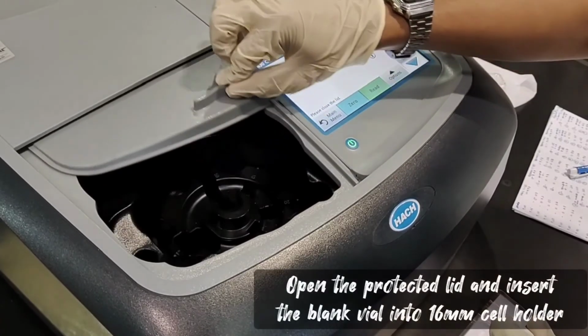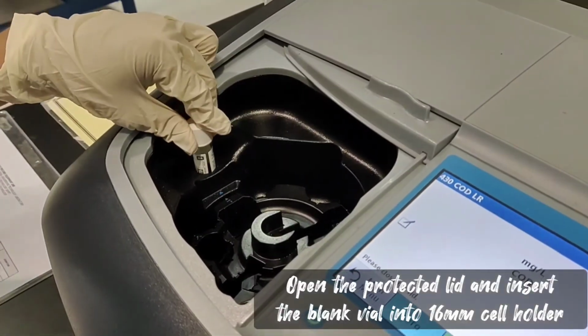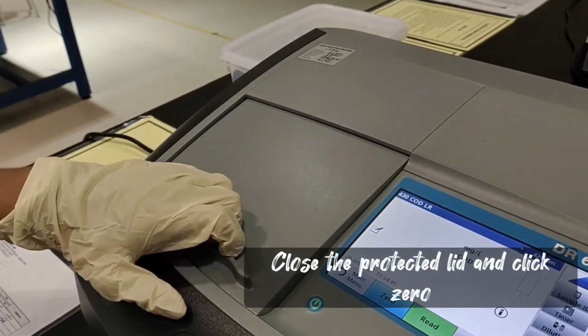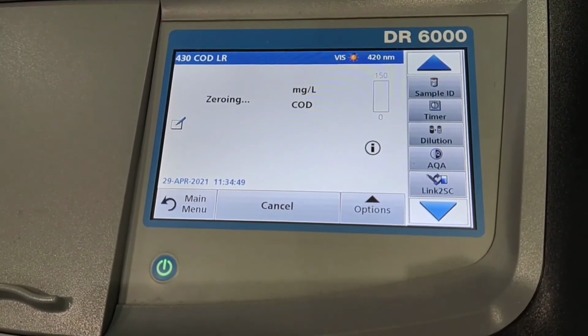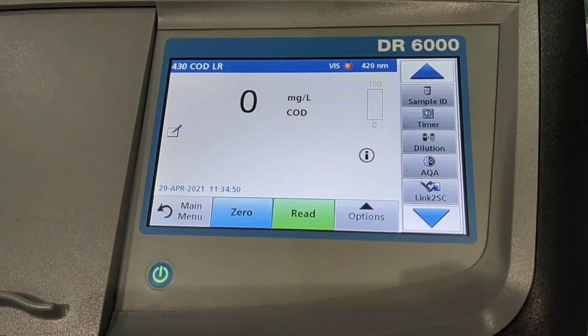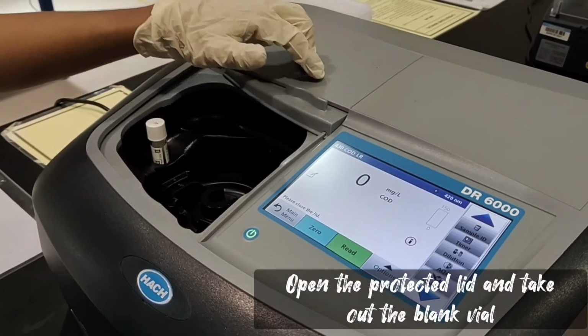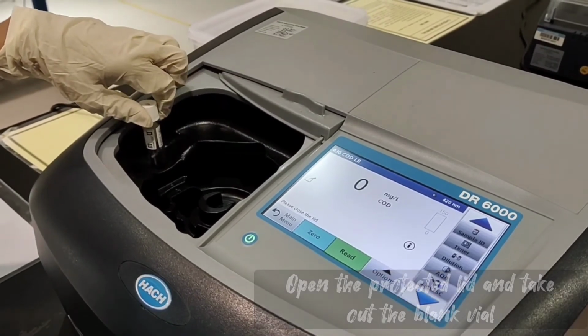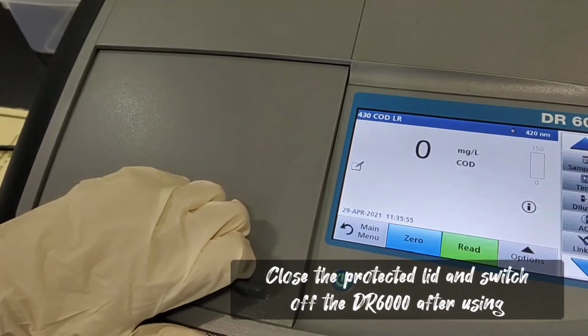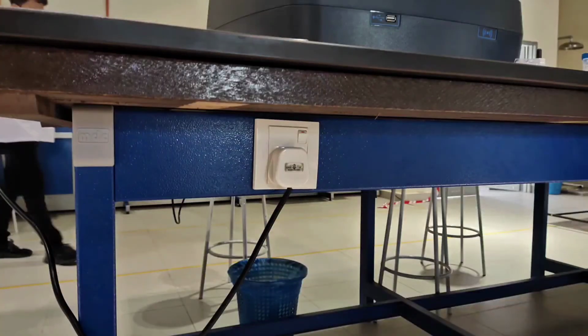And then open the protected lid and insert the blank vial into the 16mm cell holder. And then click Zero until the 0 displays on the screen. Open the protected lid and take out the blank vial. Repeat the step using the sample vial and then click Read. The COD value will display in mg/L. Last, switch off the DR6000 after using.